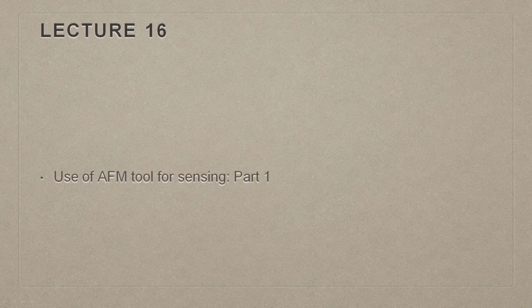So, to start off with, so this is our lecture 16, we will start with the basics of atomic force microscopy, which is popularly known as AFM. AFM as a biosensing tools. What really AFM is? As the name says, atomic force microscopy. So, you are seeing things at the atomic level. How it is being done?